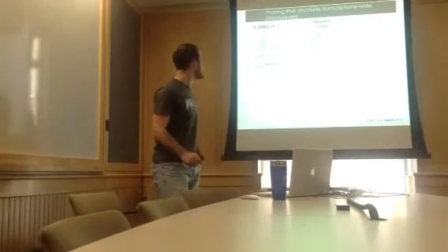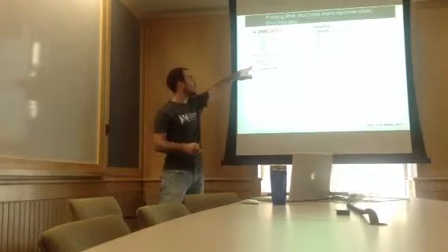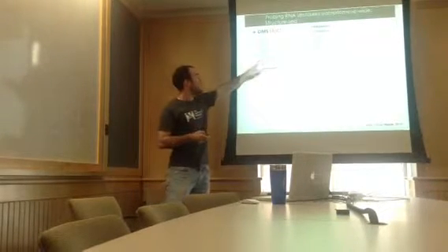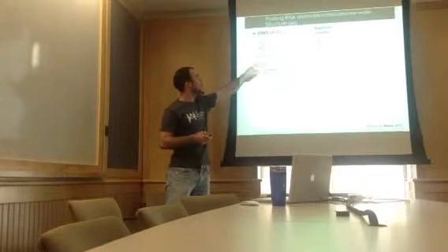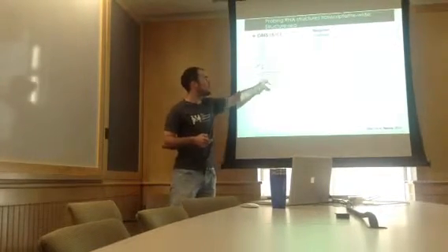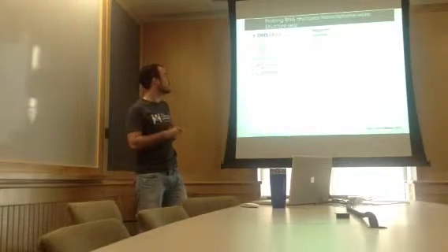And instead of using a specific primer for the RT, we use a degenerate primer with 9 degenerate positions, and our RT oligo also contains a known sequence in its 5' end. And this known sequence will be important to generate the library, the PCR, after single-stranded DNA ligation.